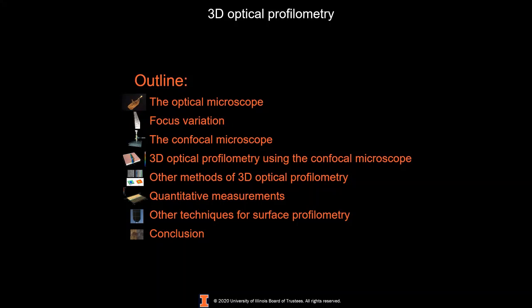She'll talk about situations where optical profilometry works well and others which are more challenging, and present some complementary strategies to measure the topography. Finally, we'll offer some final thoughts about the topic.